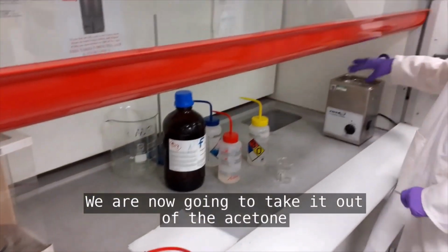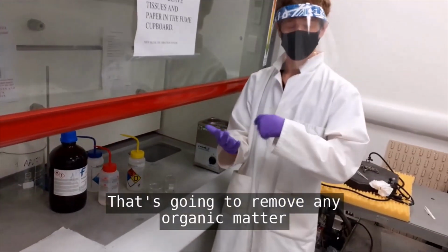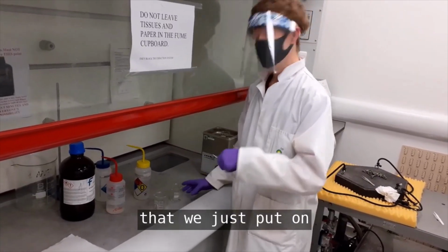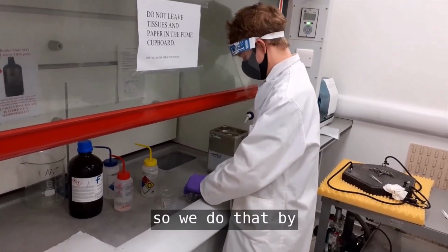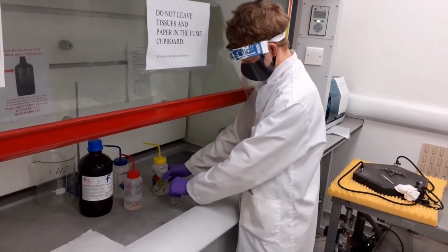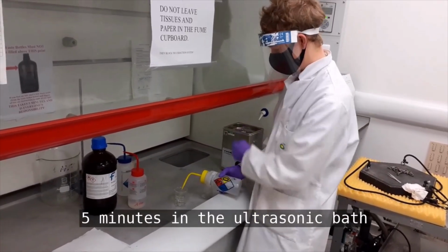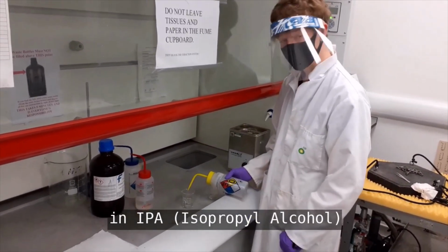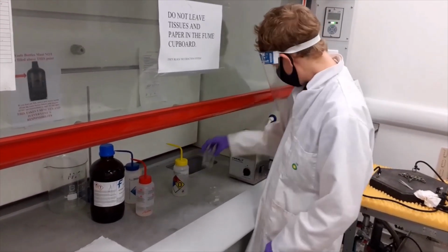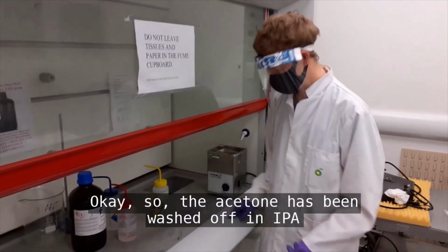We're now going to take it out of the acetone. That's going to have removed any organic matter from the substrate, but we now need to remove the acetone that we've just put on. So we do that by taking it out and doing exactly the same thing. 5 minutes in the ultrasonic bath in IPA, isopropyl alcohol. Okay, so acetone's been washed off in IPA.